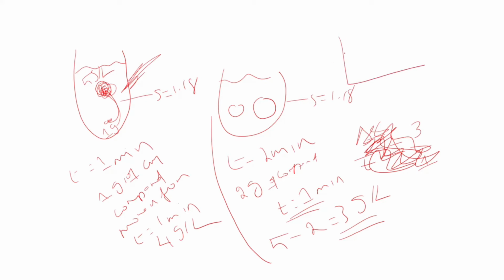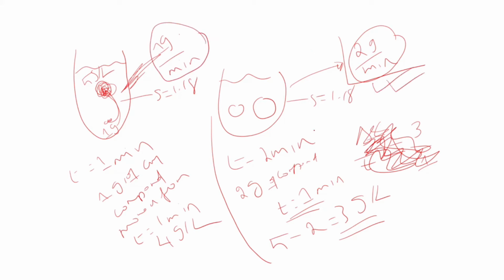Say, the change in concentration in this experiment should be like 2 grams per minute, and the depletion in concentration in this experiment will be 1 gram per 1 minute. So which means the rate is faster here. The rate is faster here.